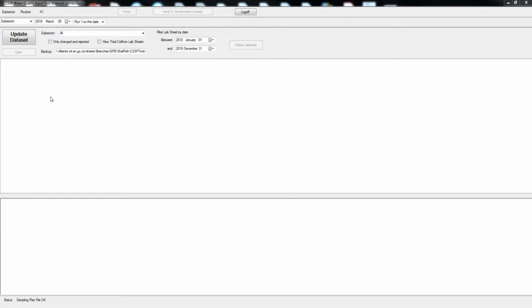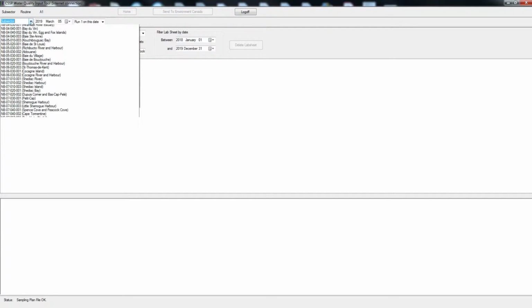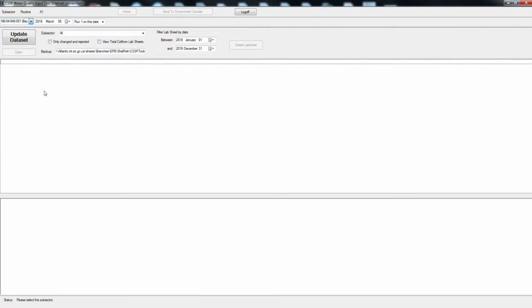In this video, we'll go over the data entry portion of the CSSP water quality input tool. First, we'll create a fictional datasheet by selecting a subsector in the drop-down list. We'll select today as the sampling date, and a new button appears right here, Create Lab Sheet.